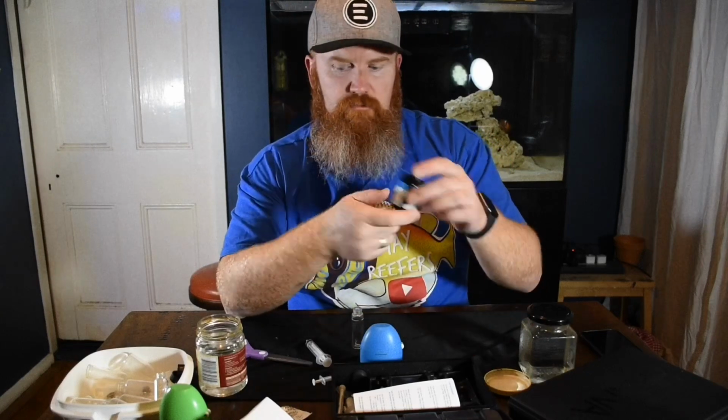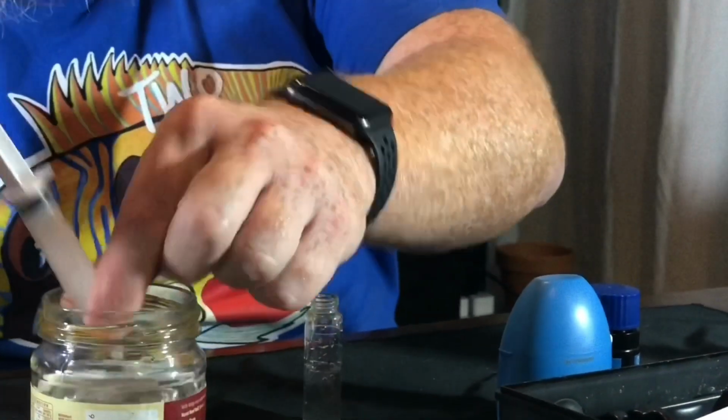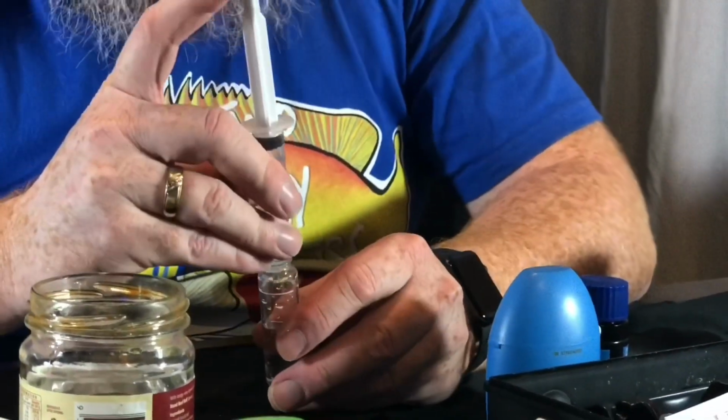Next, probably my favorite one and the easiest one. This was the first Hanna Checker system we got, which was your alkalinity. It's probably the easiest test to do, in my opinion. Get yourself your 10 mil vial. Once again, you need your Hanna Checker itself. You need your reagent. You need 10 mil of water. This is the test that I do all the time, at least 3-4 times a week or more.